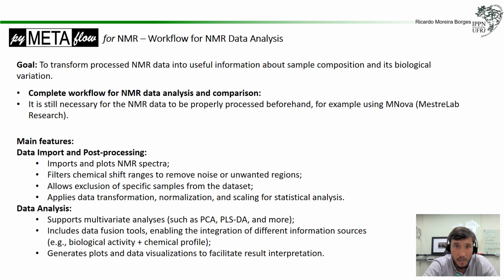Well, in Brazil, we are used to use MNova for NMR data processing, and this was my starting point. So we're gonna see that we are using as an input the CSV file exported from MNova.